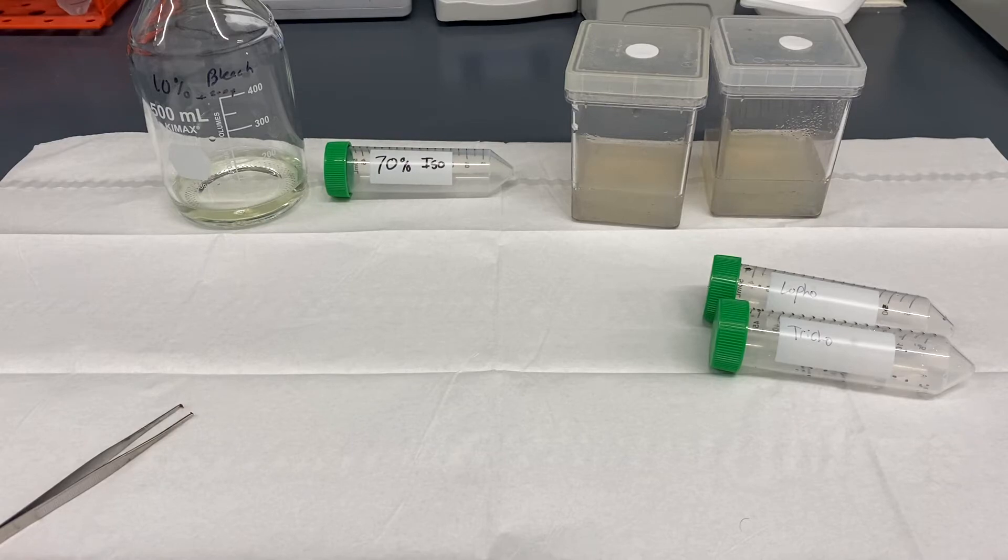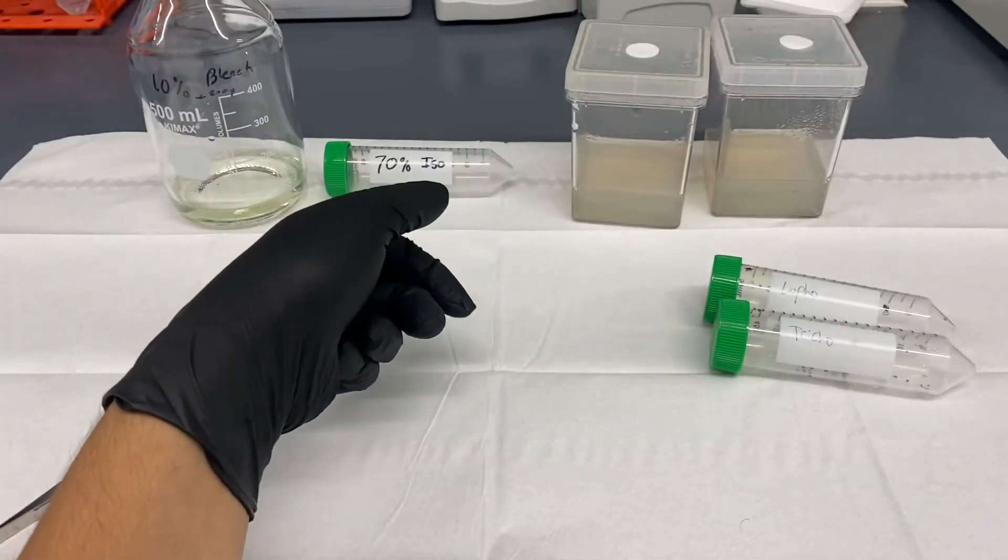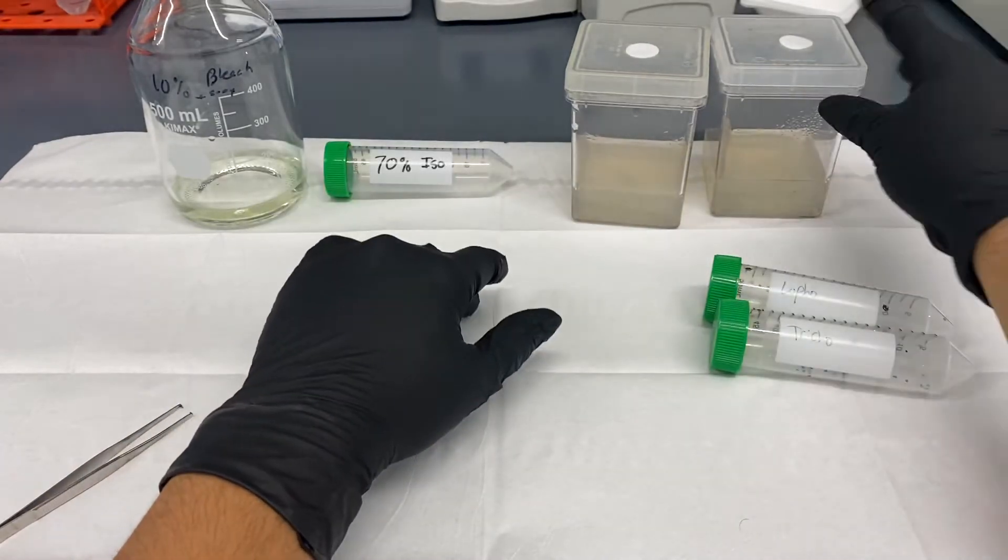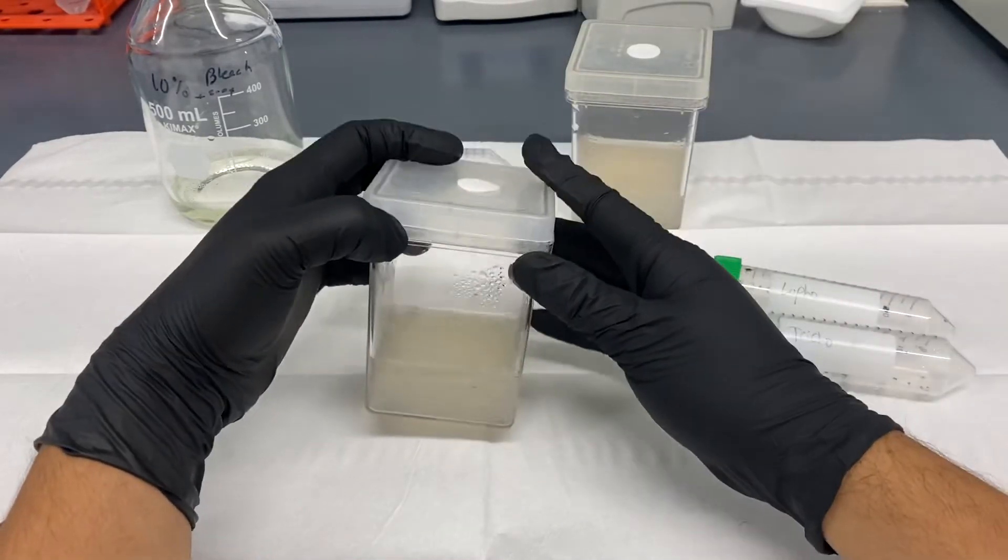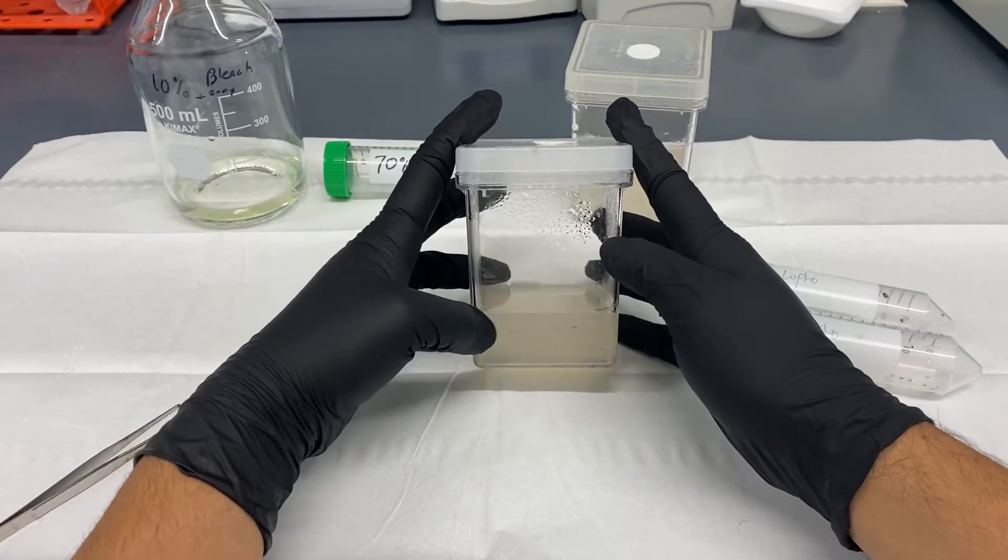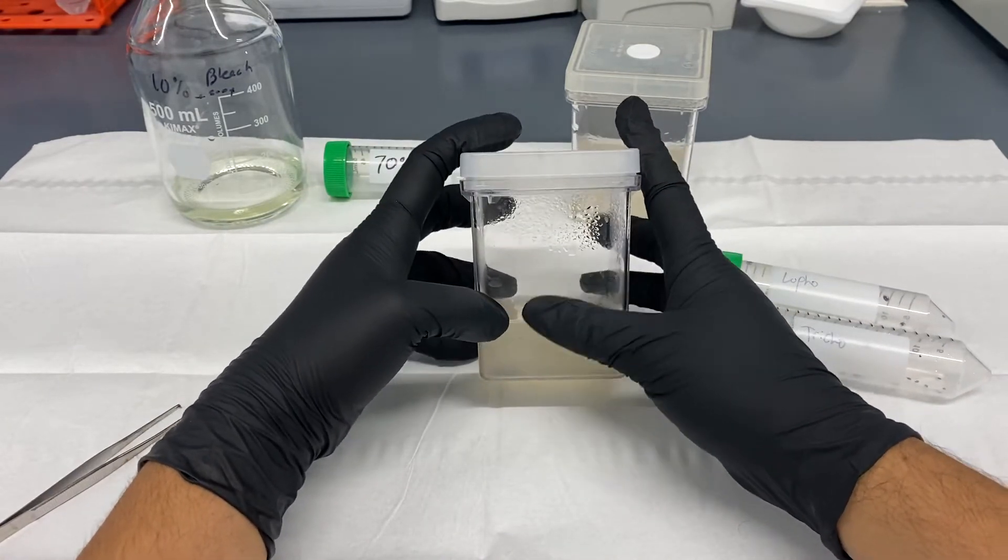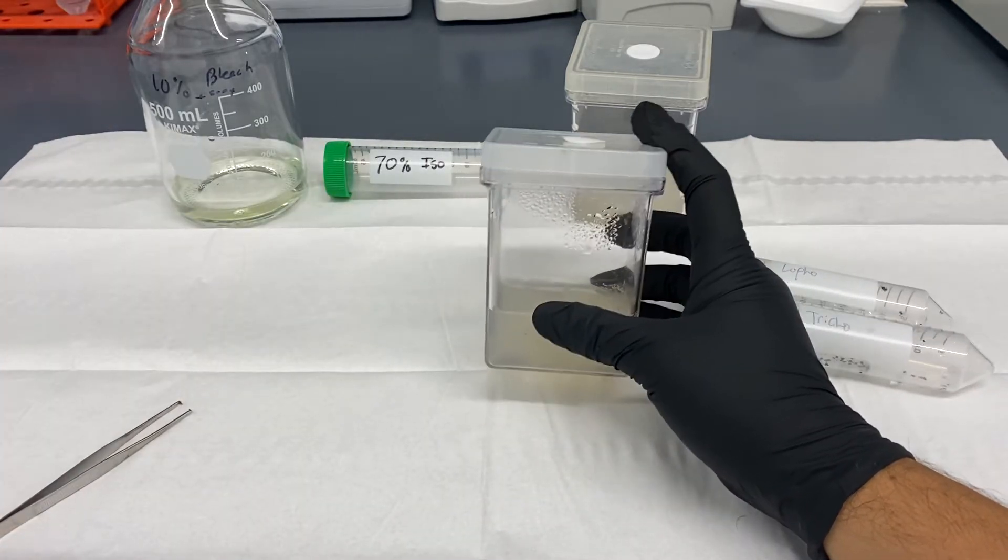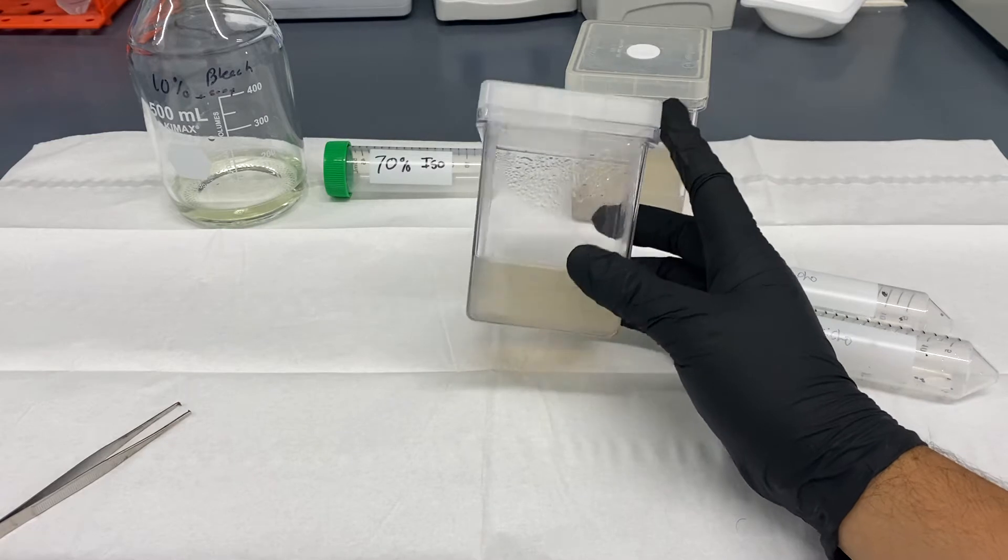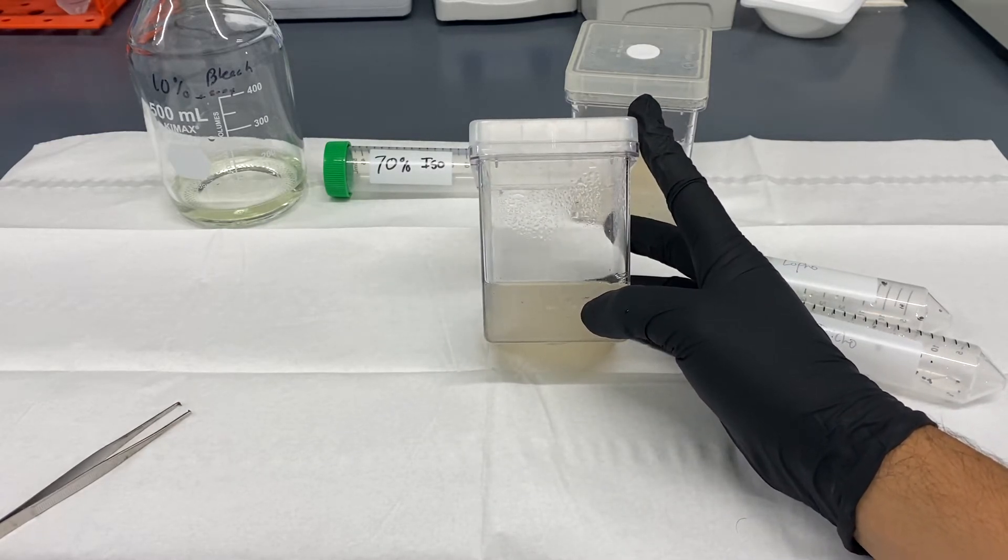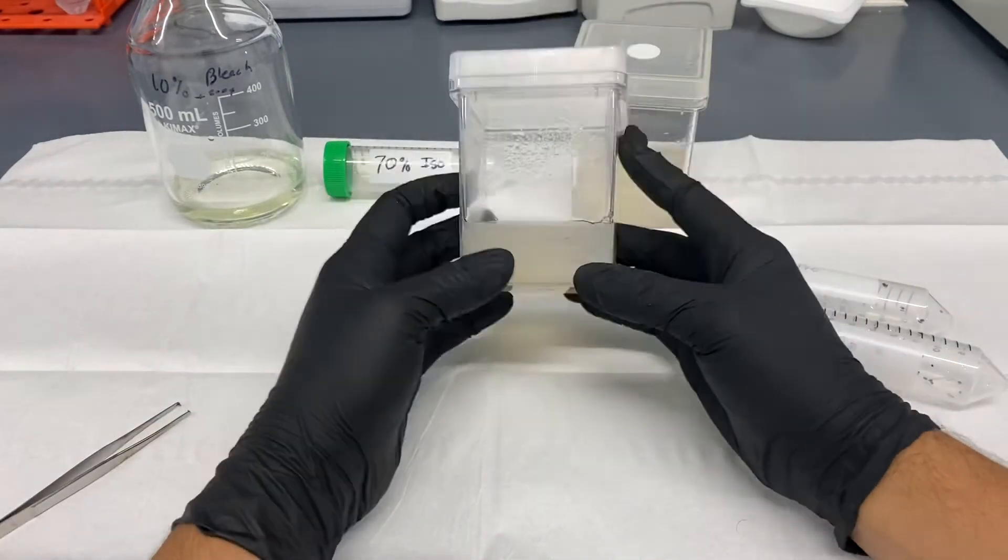So pretty much what we do is if I had an actual cactus here I would cut it up into a bunch of pieces and place that onto this media. This media I'm going to show you guys how to make in another video is actually MS media, Murashige and Skoog, they are the creators of this salt mixture that's able to support plants.